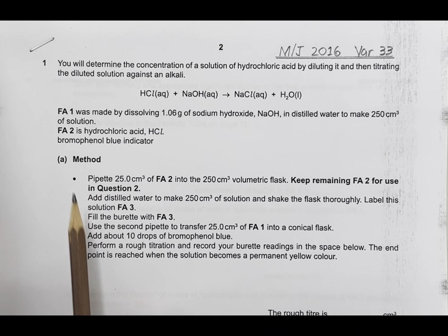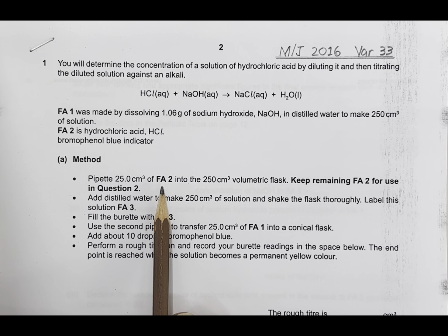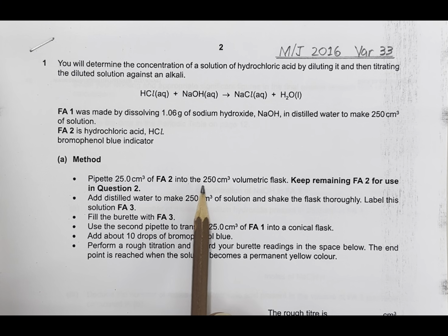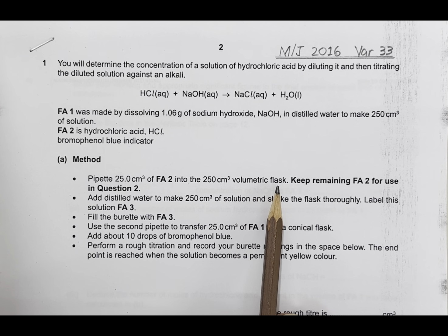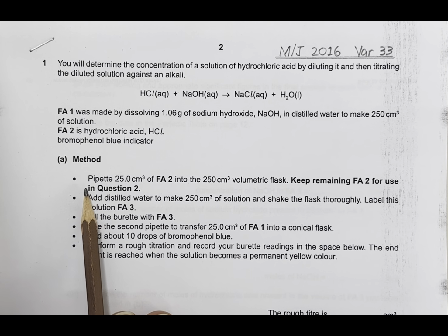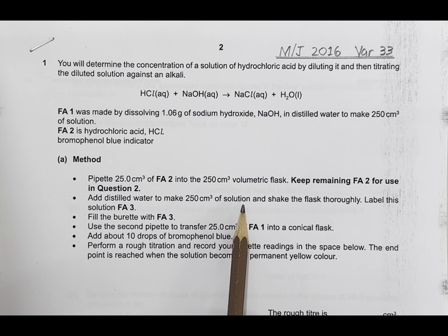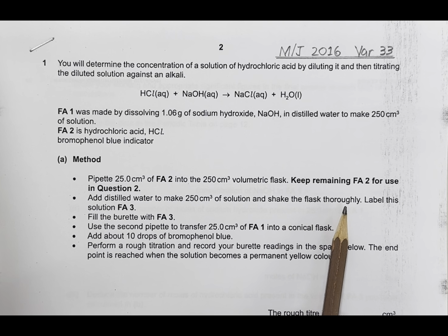Method says pipette 25 centimeter cube of Fa2 into 250 centimeter cube volumetric flask. Keep remaining Fa2 for use in question number 2. That is the next question in this paper. Add distilled water to make 250 centimeter cube of solution and shake the flask thoroughly.